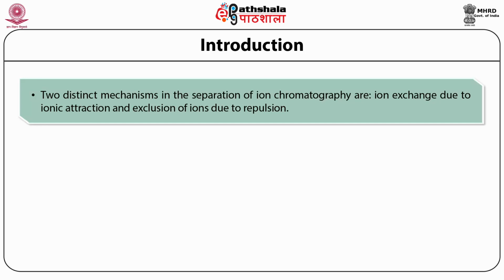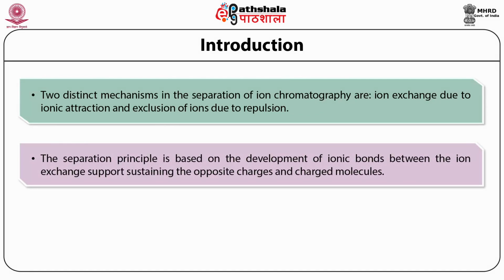Ion exchange has been the prevalent mode of ion chromatography. The separation principle is based on the formation of ionic bonds between the ion exchange support carrying opposite charges and charged molecules.